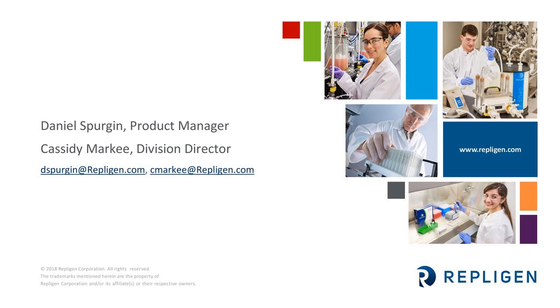How do you estimate the impurity removal based on the sample volume and the amount of liters passed through the system?